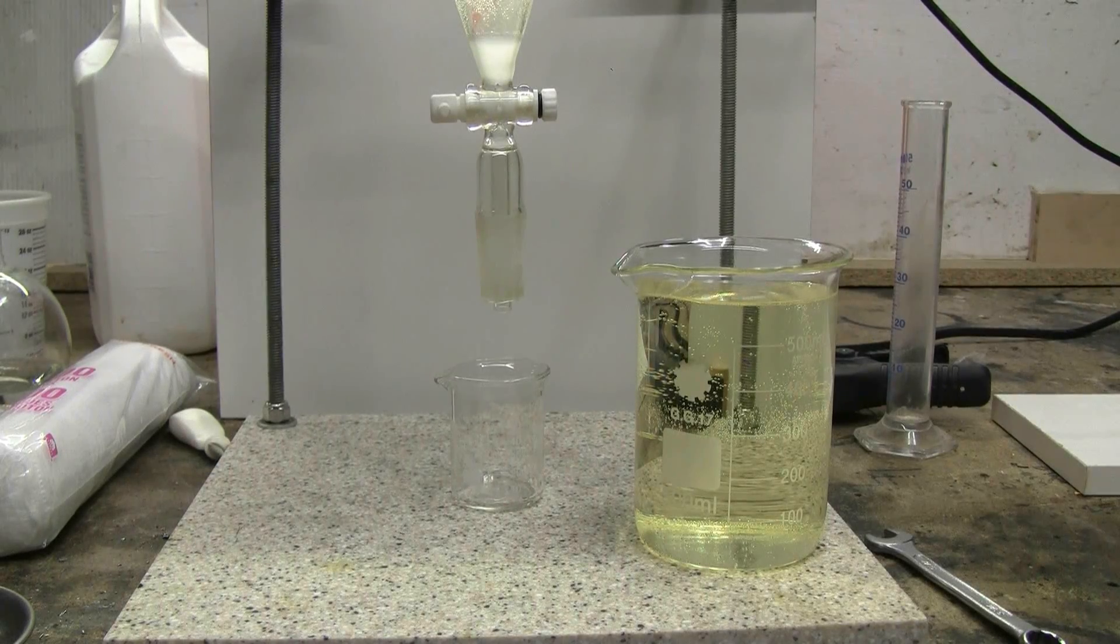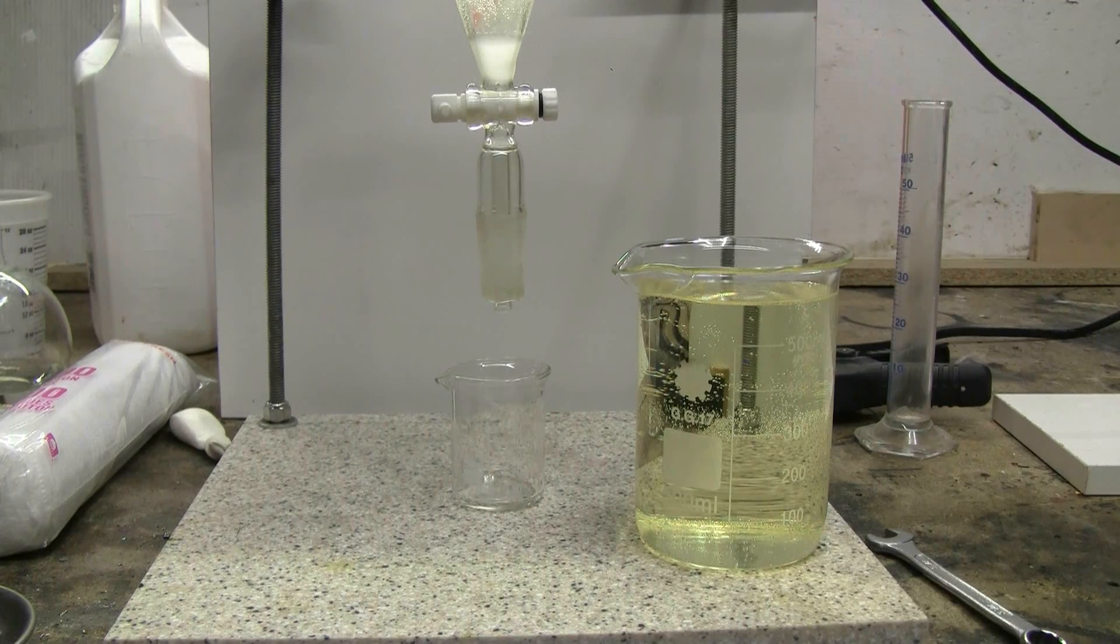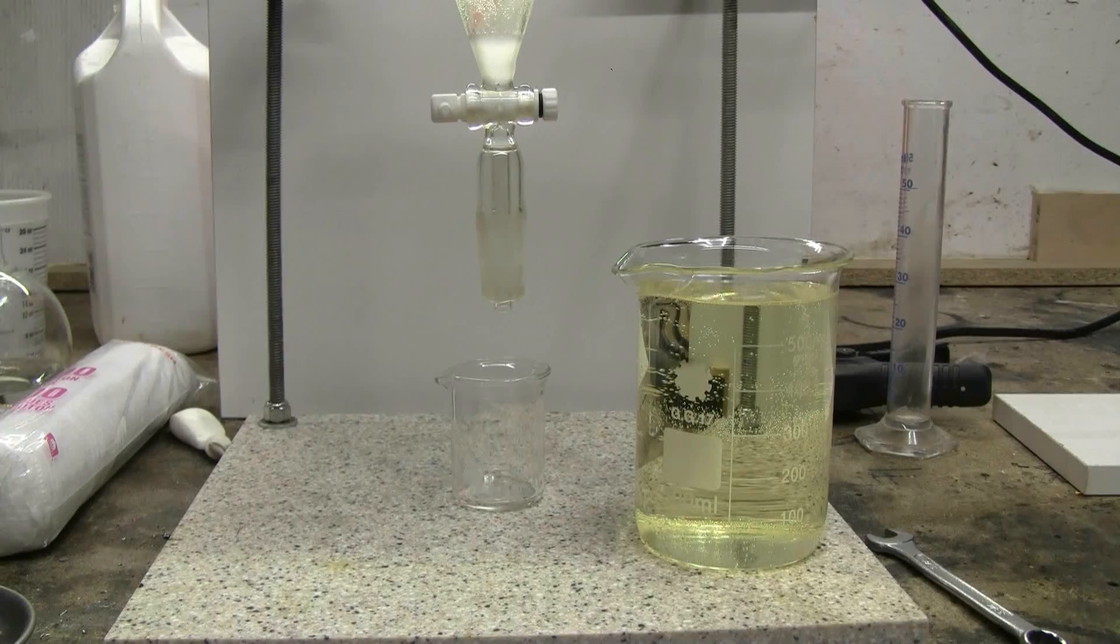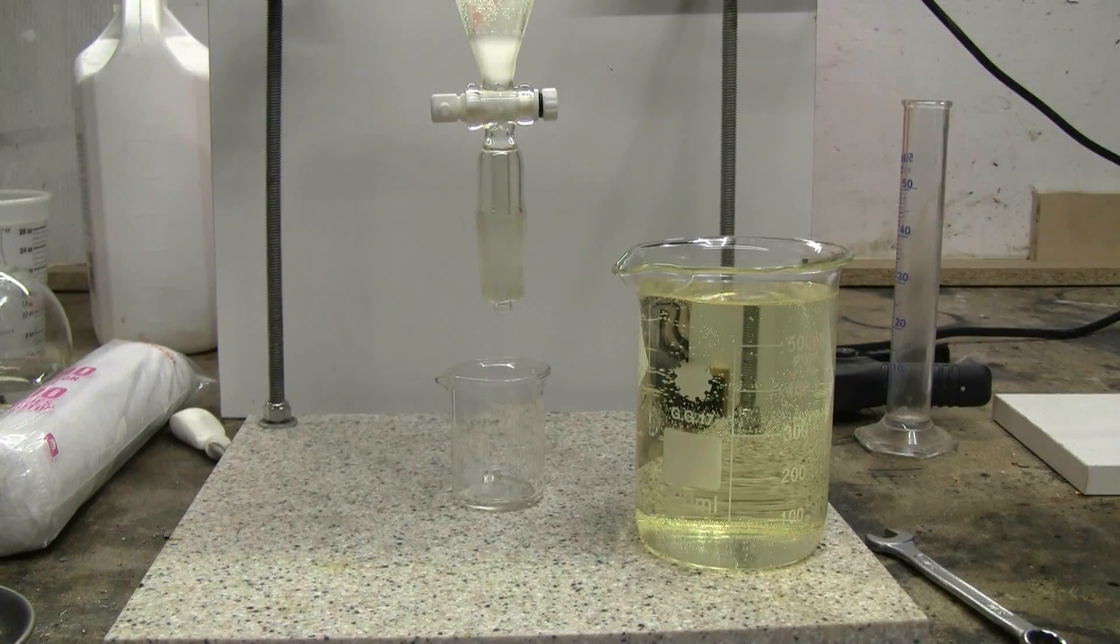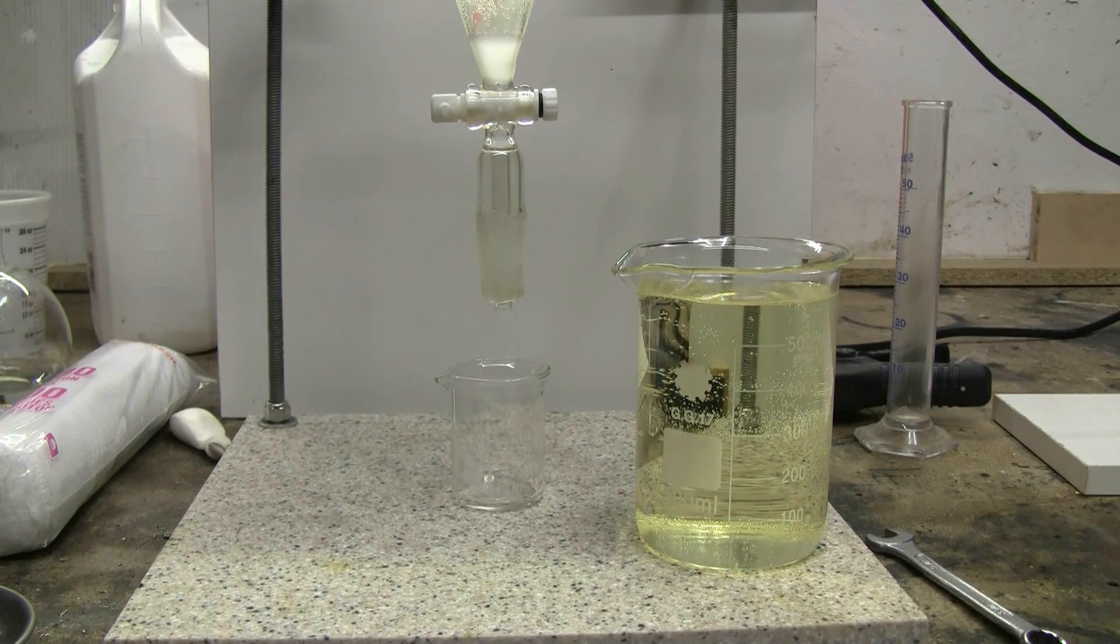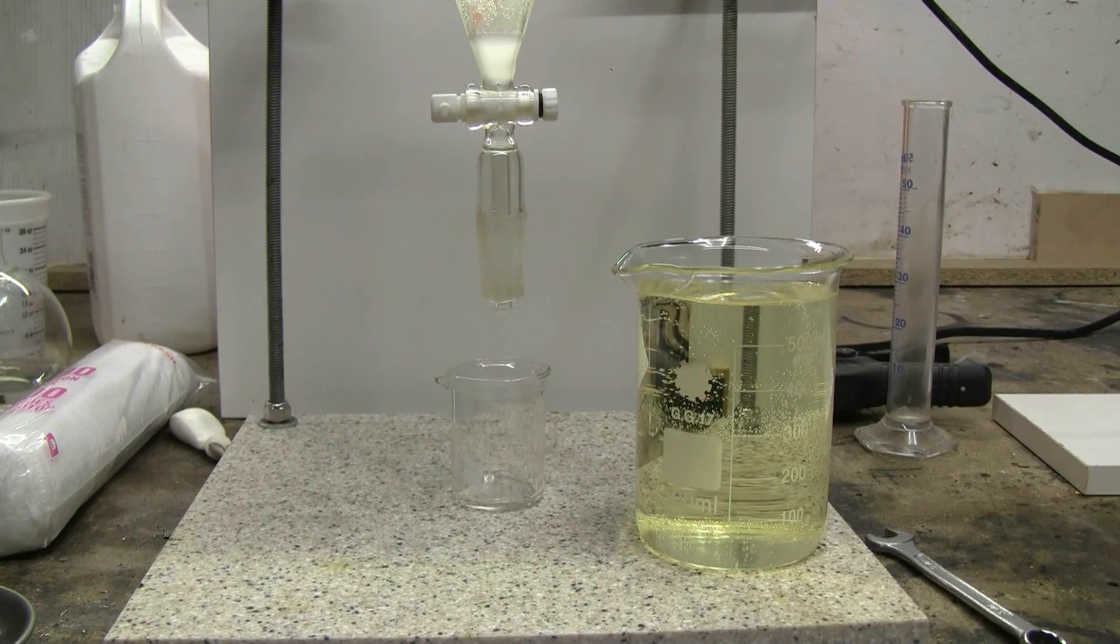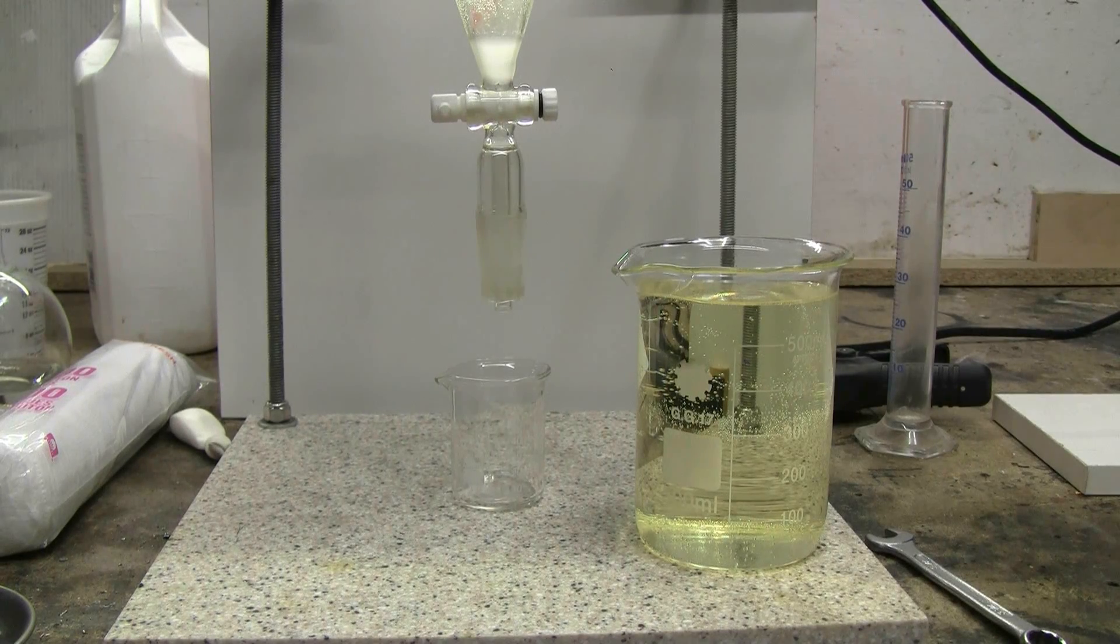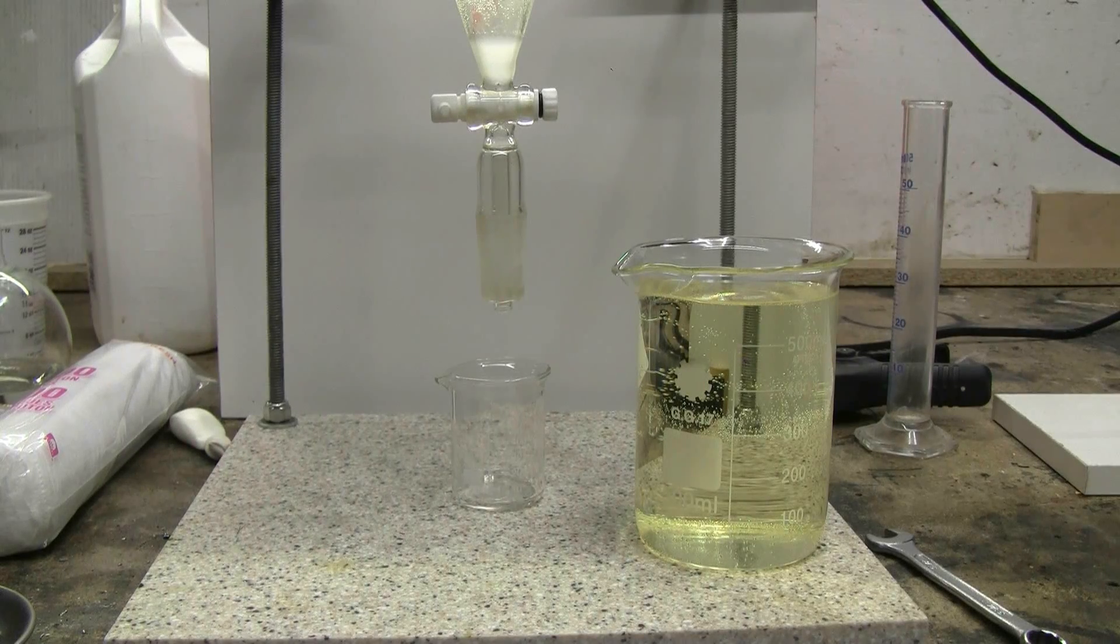What I've done at this point is take both 500 milliliter beakers that I did the haloform reaction in to make chloroform. I poured the dominant top layer which is like 95% of what you get out of the two beakers and you can see this waste layer almost filling the beaker on the right.